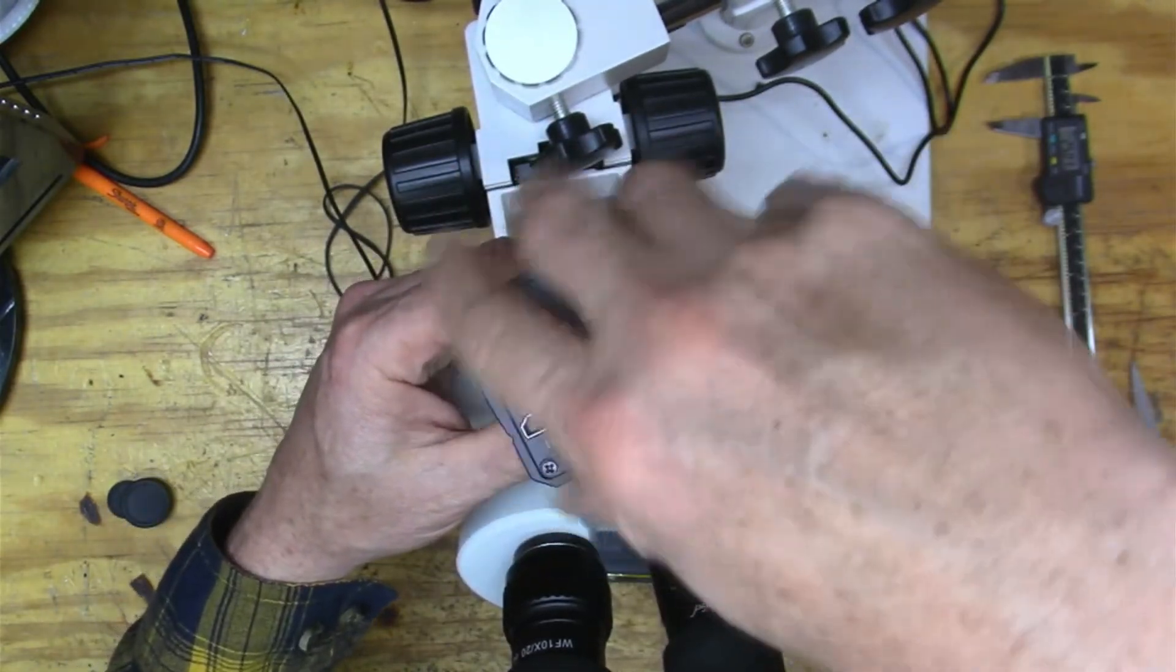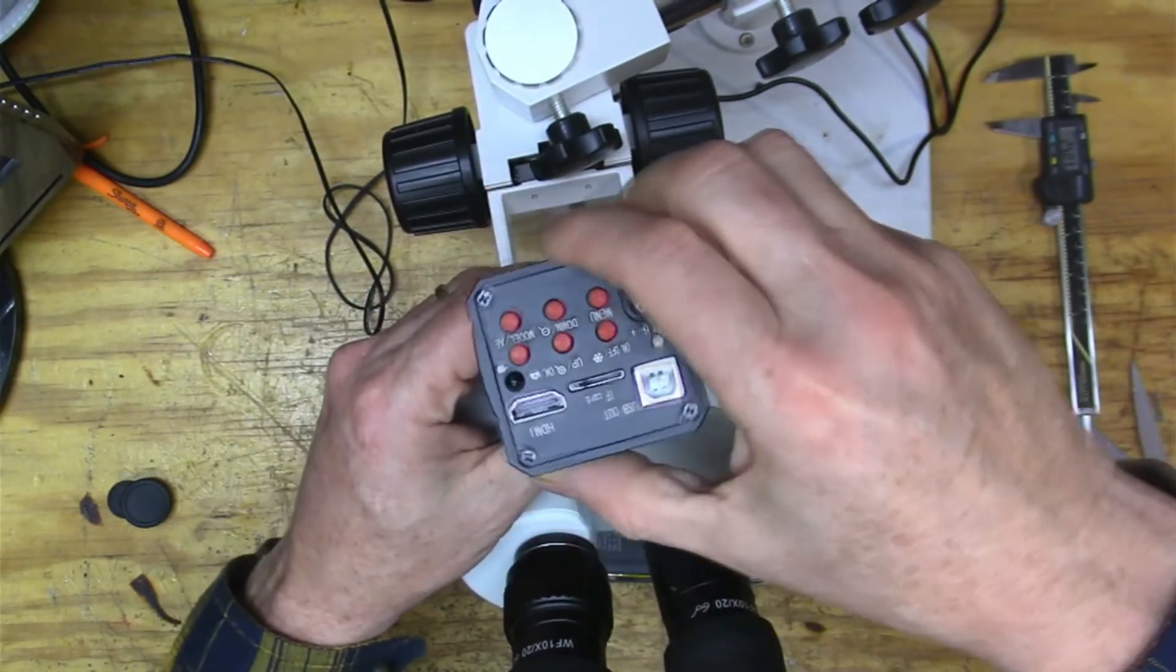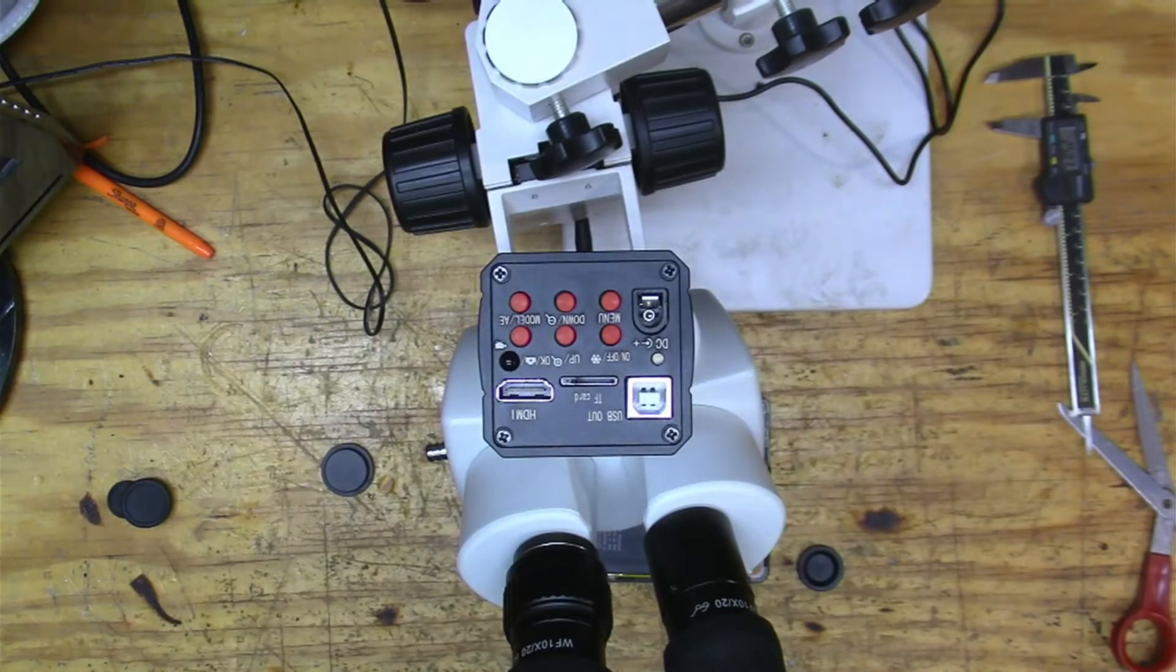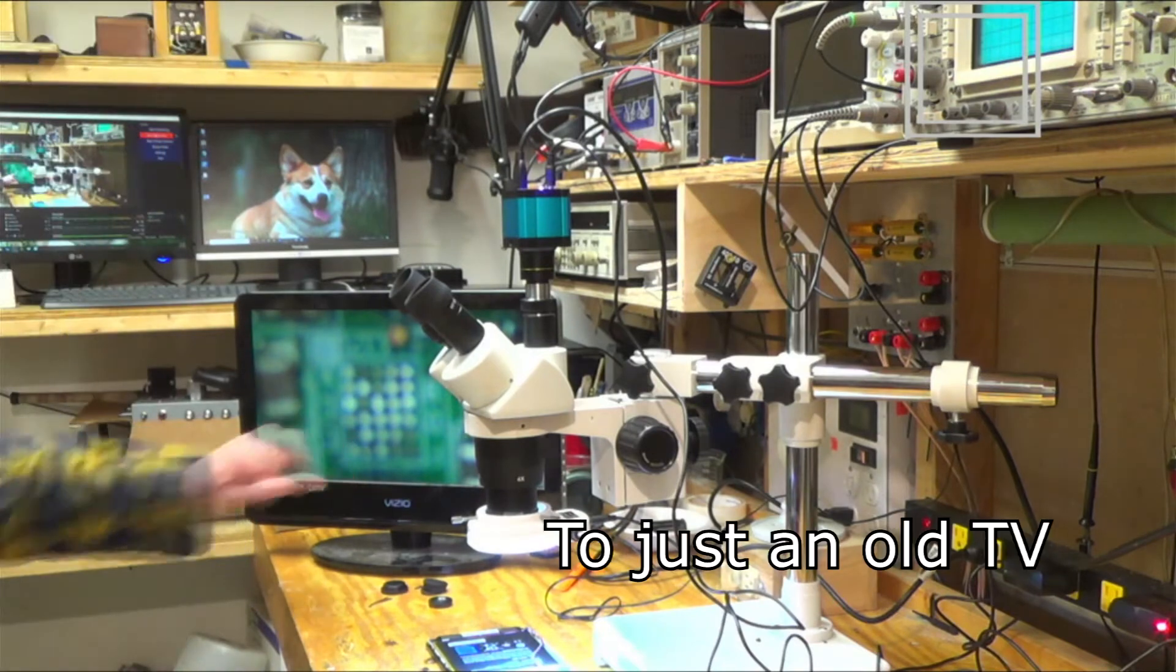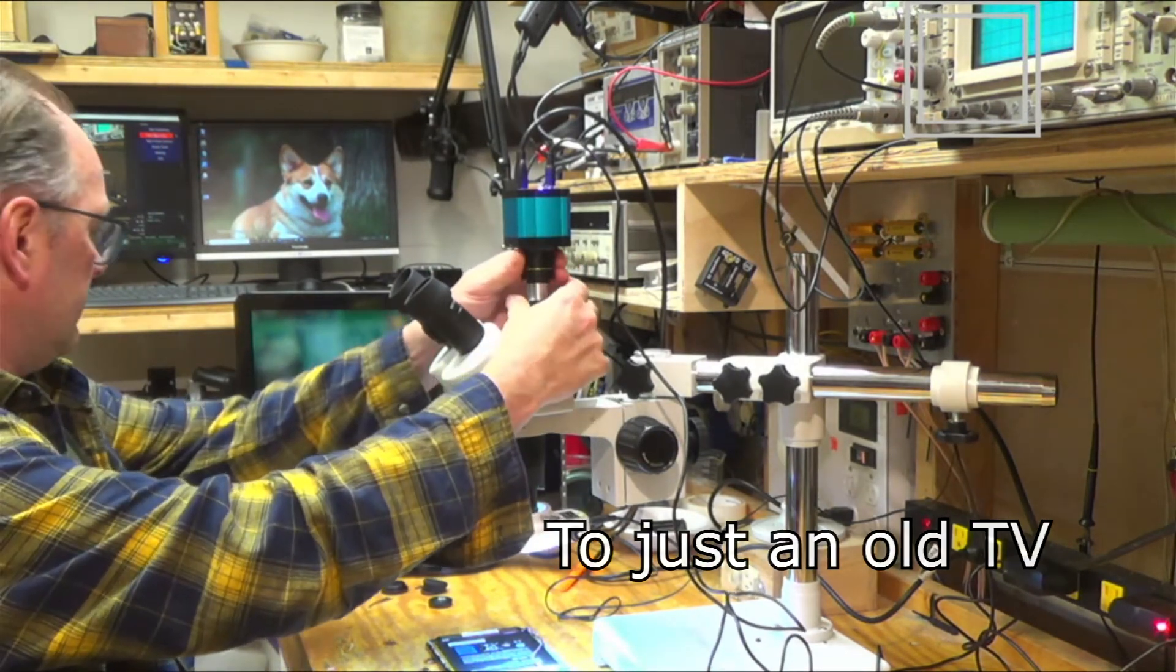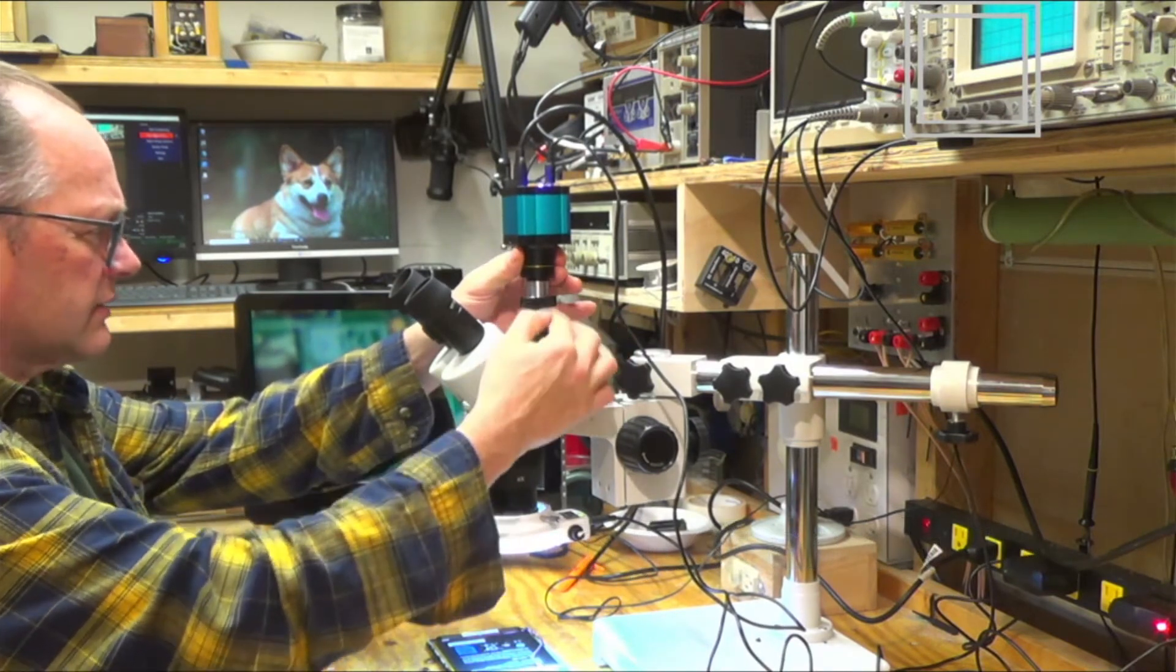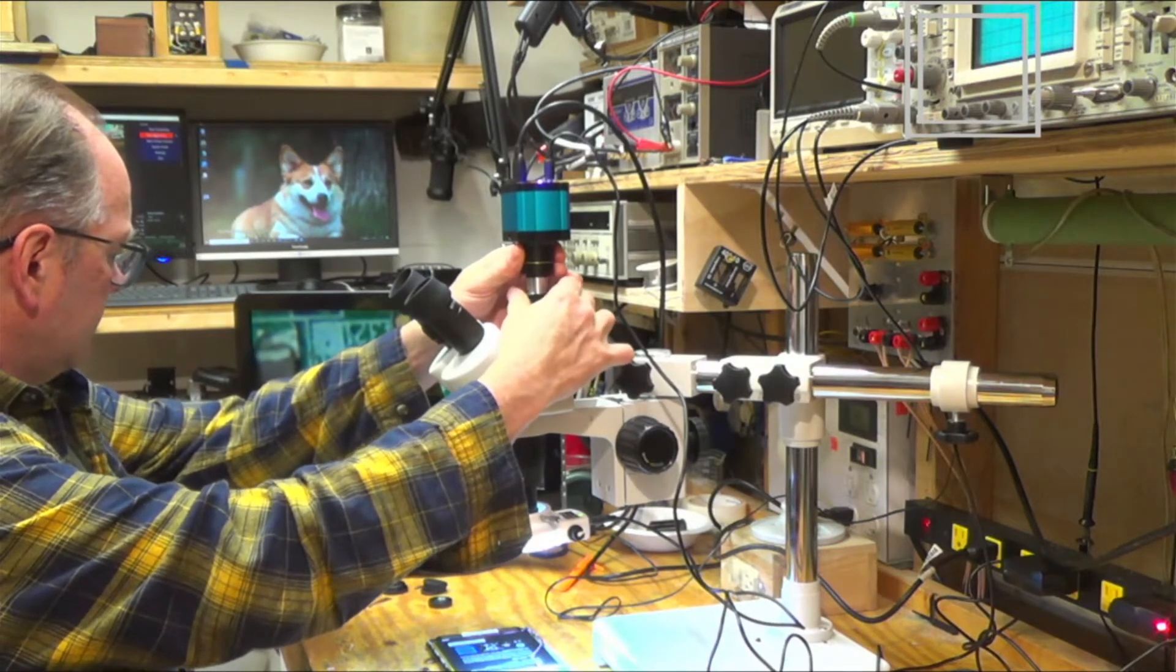I just got to screw that on there. And I think type C is kind of a standard camera mount. All right, so there, we got that on there. All right, so there, there we have our image coming in. And so now we just turn this guy here. And like I said, this barrel came with the microscope. Turn that out.